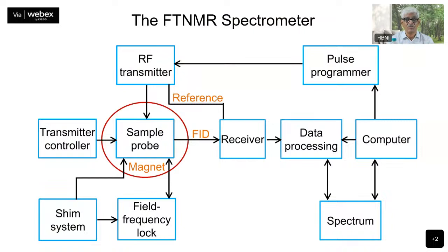So we are going back to the spectrometer now. We will have to see what all the spectrometer components are, what the instrumentation is, what the operator or user has to do, how to get the best spectrum, and of course the analysis follows later on. We have been going through the theory of NMR over all the various experiments, but until you actually sit on the spectrometer and do the experiments yourselves, you will not be able to appreciate that. You have to know the various components of the spectrometer.